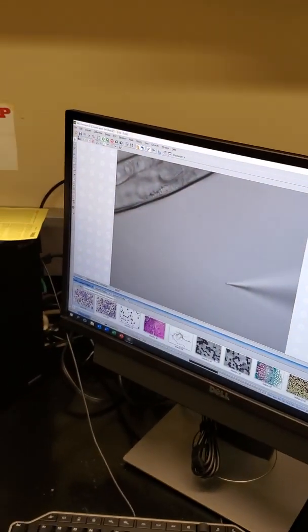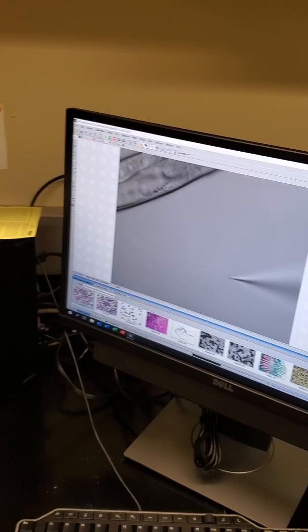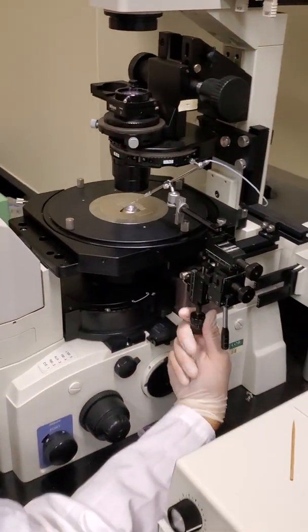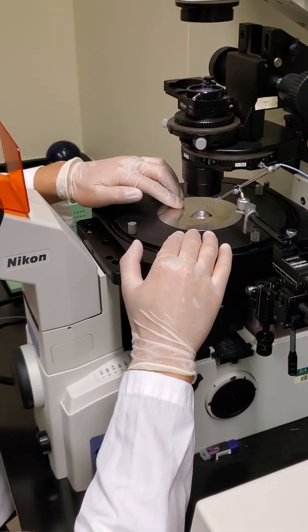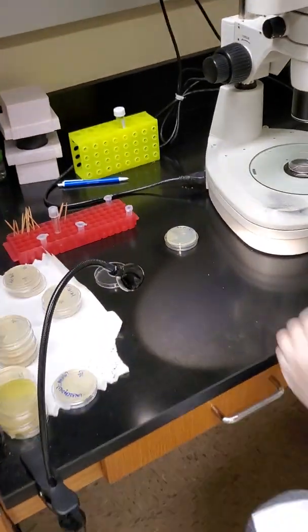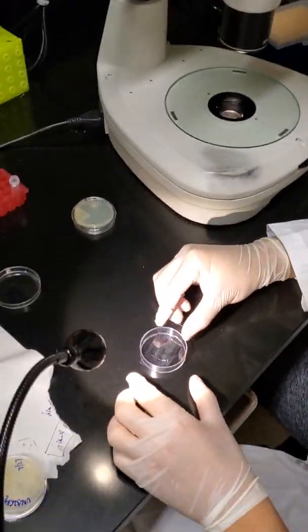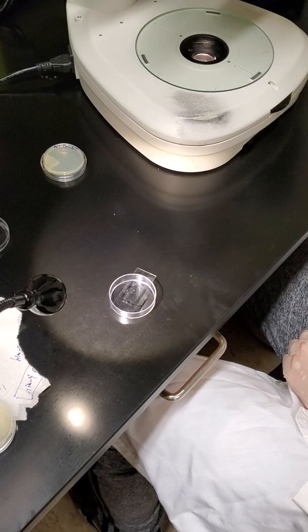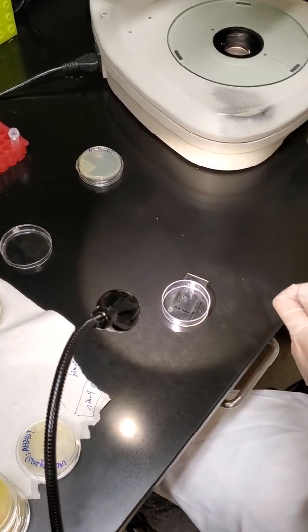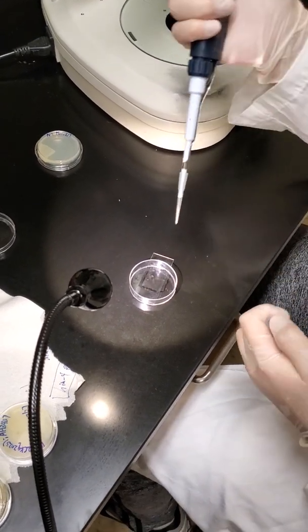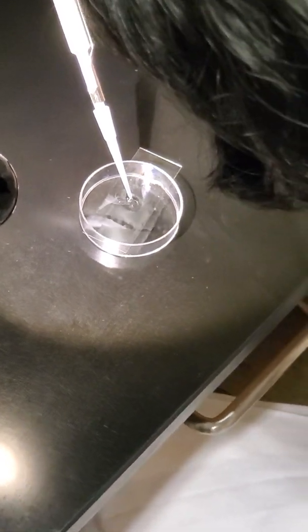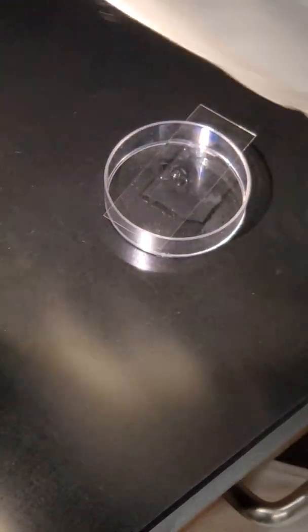So this worm has now been injected with our DNA. Of course, in this case, it's just M9 solution. And so all we're going to do is we're going to take this slide back over to the dissecting microscope. And if you have multiple worms, you can just drop a drop of M9 onto all of them to keep them from drying out. And then you can pick each one and put them in their own petri dish. And so each successful P0 worm that you inject will have its own dish. So you don't have any crossover between worms that you've injected.